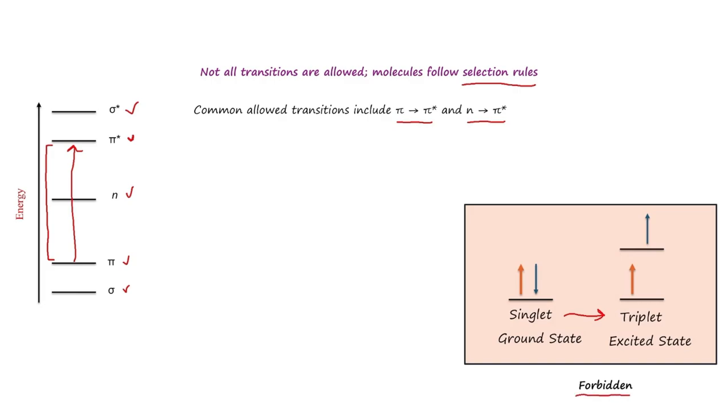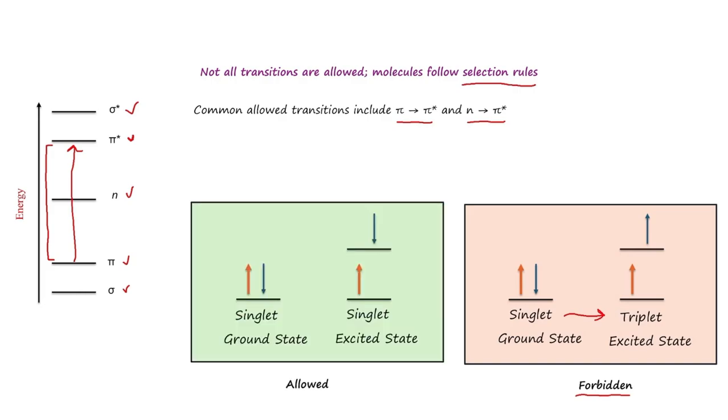In a typical singlet ground state, electron spins are paired. Excitation can keep them paired in a singlet excited state, or much less commonly lead to a triplet state through so-called intersystem crossing, where the spins become parallel, just like you see here in this picture.